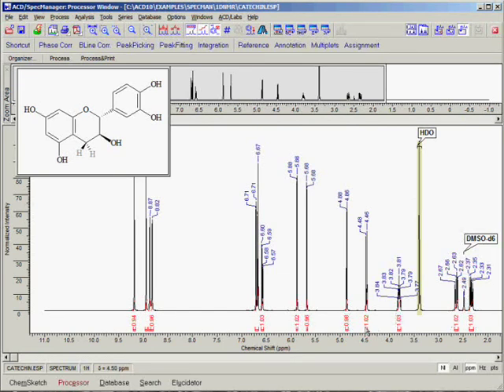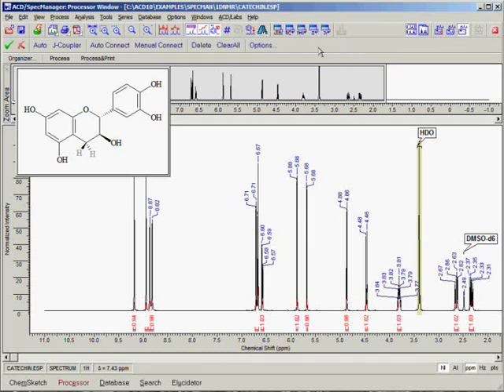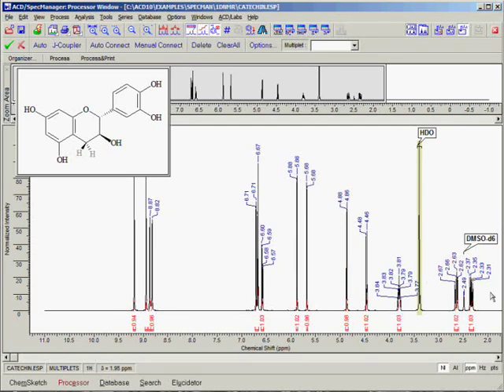In order to begin multiplet analysis, we click the Multiplets button on the Operation Toolbar. When creating multiplets, we can work from left to right or vice versa. Here we will start on the right and work our way to the left.